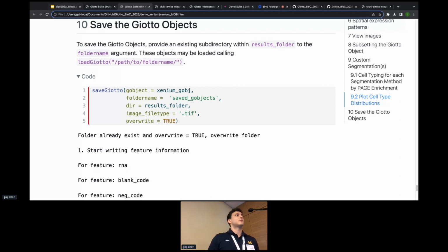Right. Could you repeat the question a little bit? So the question was, how do we deal with scalability with the transcript spot data? Those can be like 30 gigabytes. Yeah, specifically for Merfish, because that entails very large sizing, up to around 30 gigabytes.